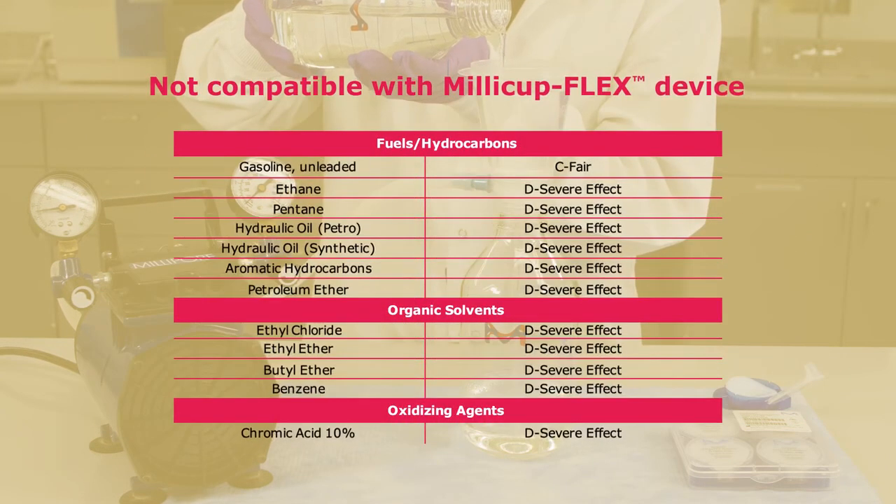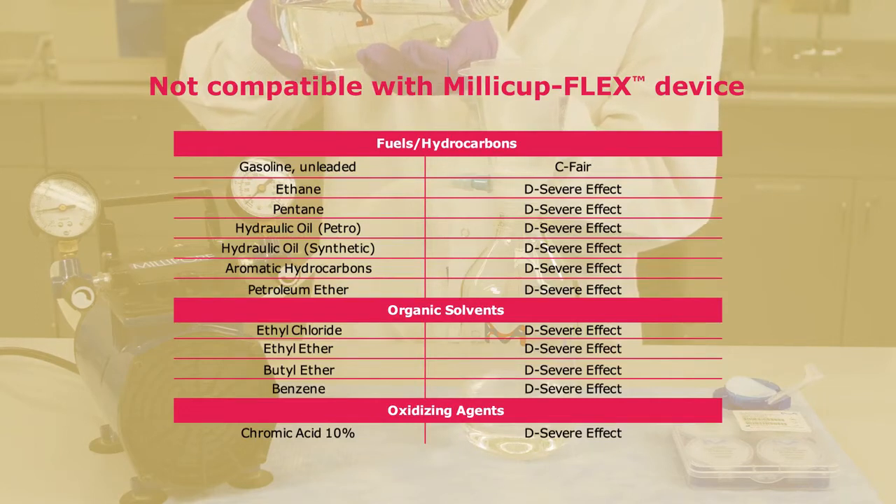Some solvents and materials are not compatible with the Millicup Flex device. Reference the following table for chemical incompatibilities.